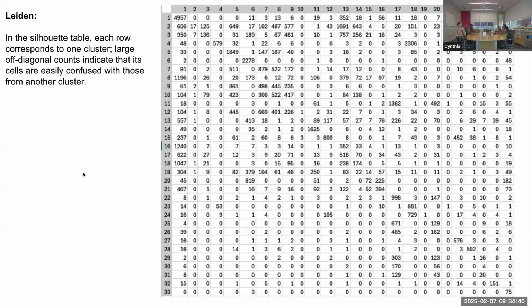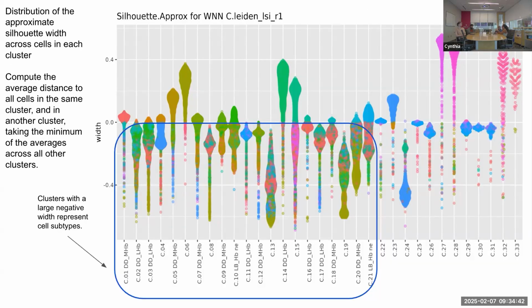Also, this is very difficult to read because it's not seen here, but there is a color scale that says something like that. For example, the pink are the most specific cell types, and then the scale starts to change in color. So it's really difficult to interpret the colors when we have this kind of projection.